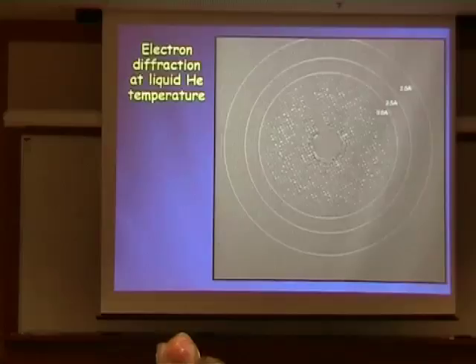The other advantage of the microscope in Japan was that we had a 4K by 4K CCD, so we could use a longer camera length to get much better diffraction, where we could actually get a better background. So we got these very nice diffraction patterns, and 3 angstrom is the data that we used to get the first structure that we collected in Boston.